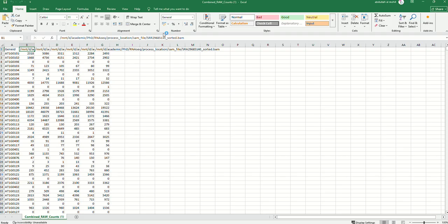So you can see according to their serial, they have been sorted here. Like this 35, this 36, this is 37. Okay, you can see it here. This is 38, this is 39, and the final one is 40. Okay, but we have to trim it.